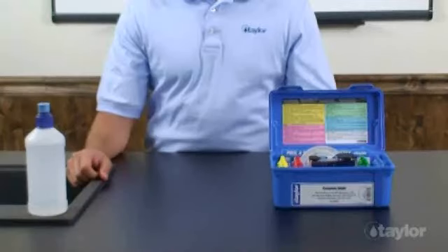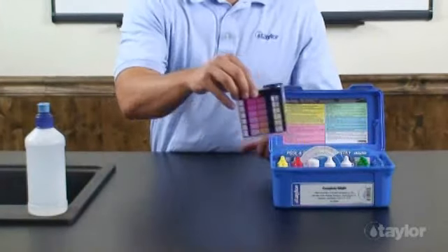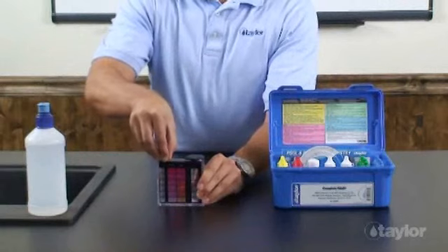To test total bromine, rinse and fill the small comparator tube to the 9 mL mark with the water to be tested.